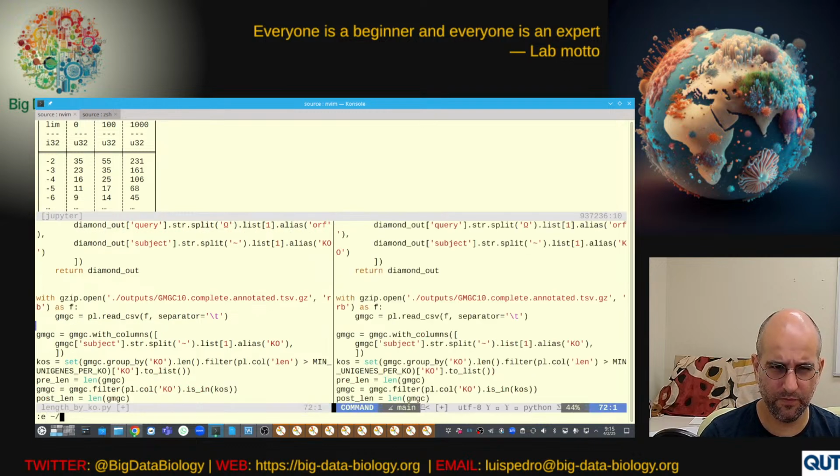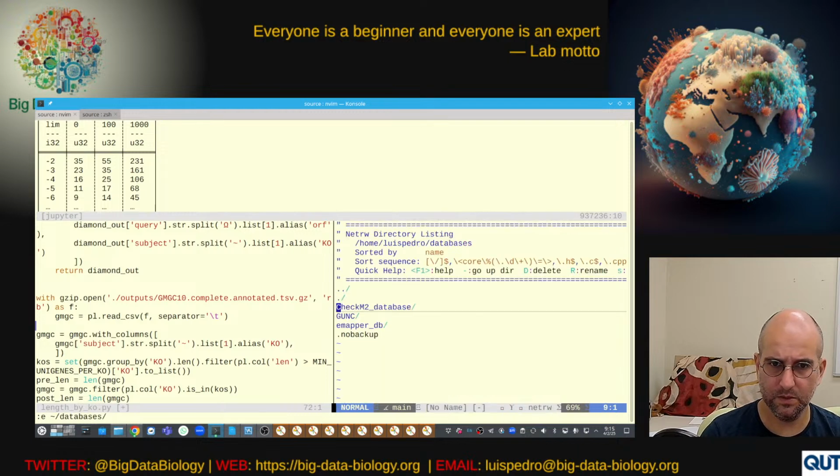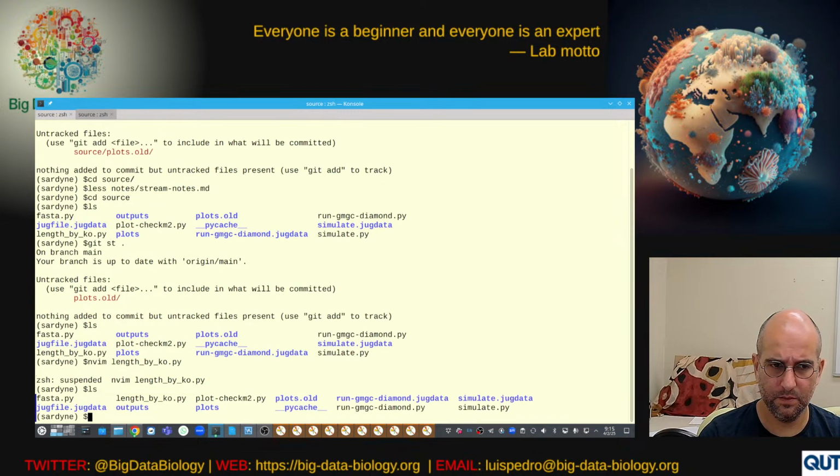What am I looking for? Databases, CheckM2. Sorry, I remember.